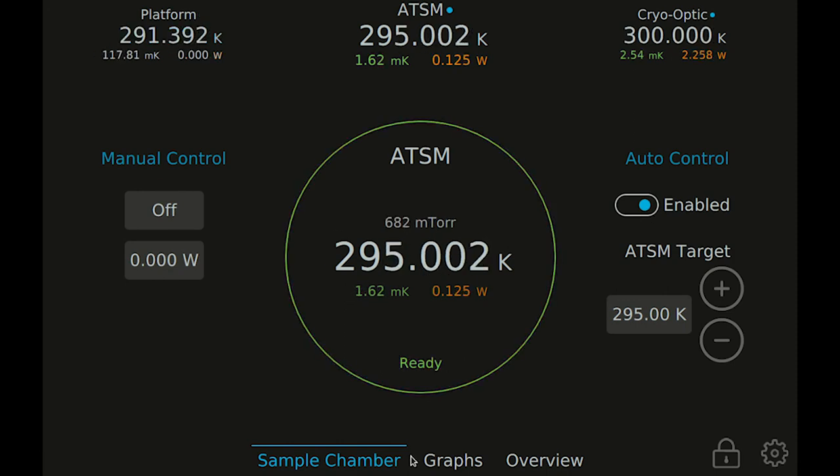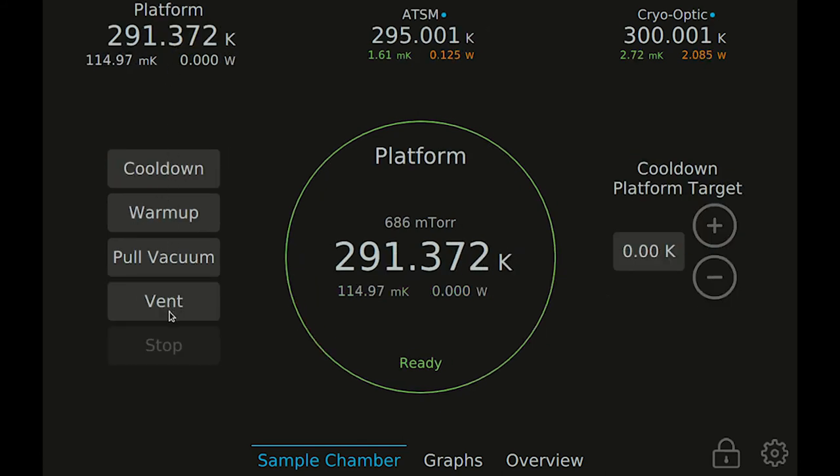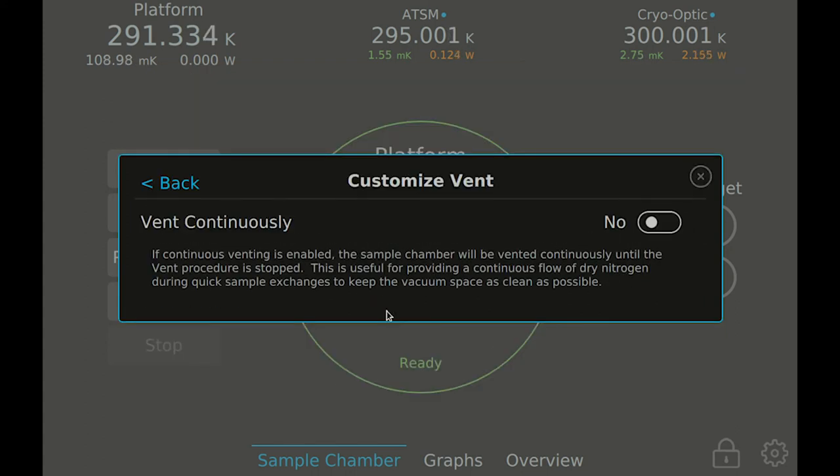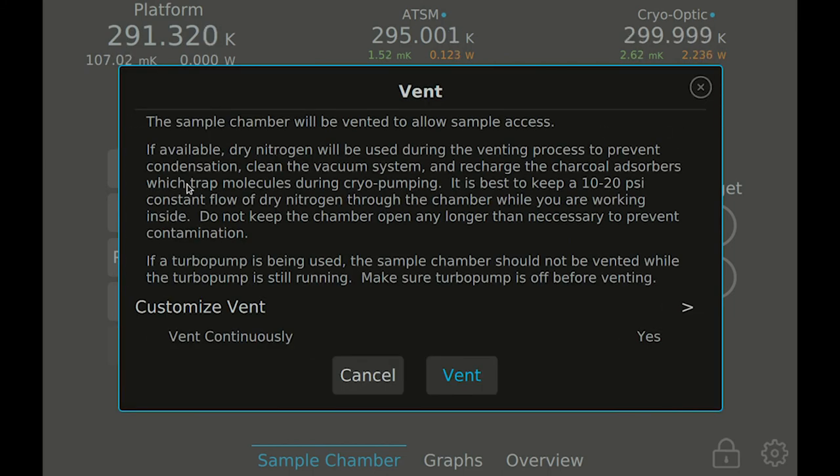After the system is warm and when you are ready to exchange your sample, use the vent button to vent the sample space and break vacuum. If dry nitrogen is connected to the system, dry nitrogen will be used for a few minutes to push contaminants out of the vacuum space and to recharge the charcoal adsorbers. If you plan to do a quick sample exchange, you can also choose to vent continuously with dry nitrogen until you hit stop. This allows you to maintain a positive outflow of dry nitrogen gas while working in your sample space to further reduce contamination while the lid is off the sample chamber.